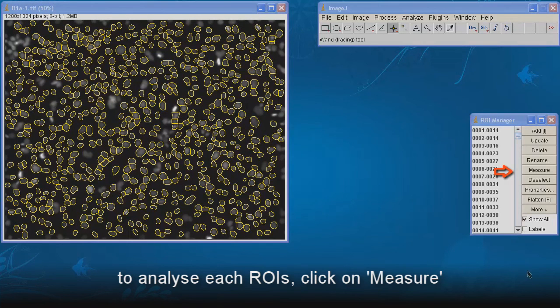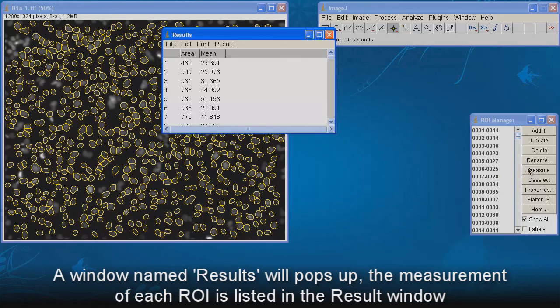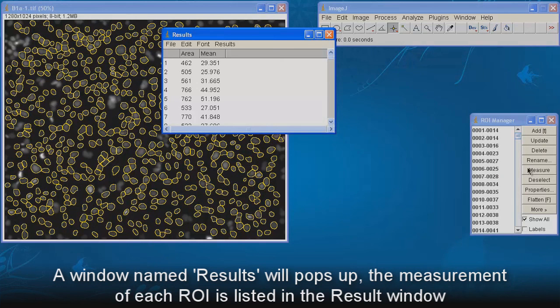To analyze each ROI, click on Measure. A window named Results will pop up. The measurement of each ROI is listed in the Results window.